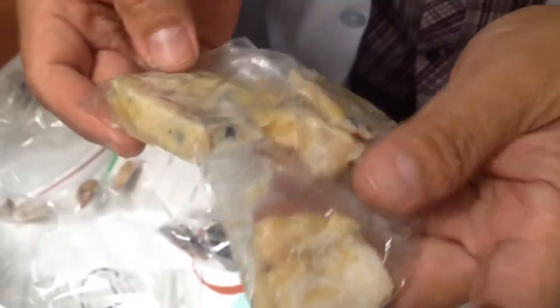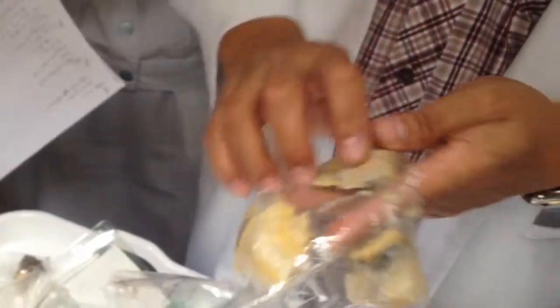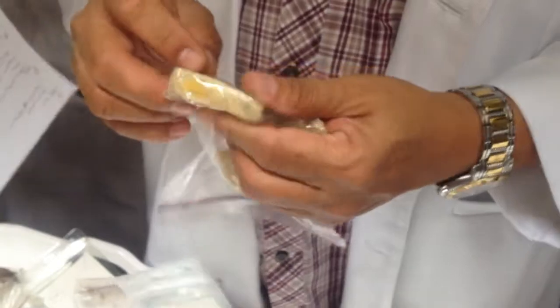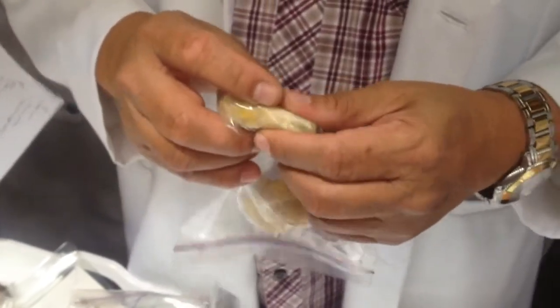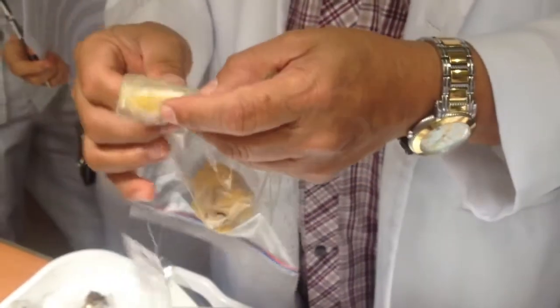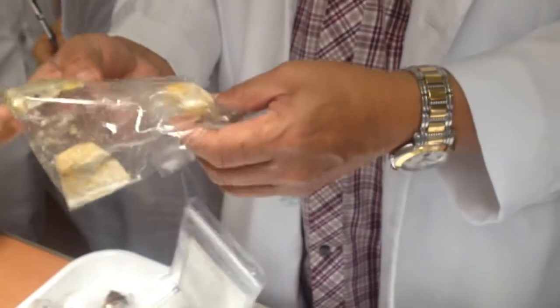Okay, so this is fibrocystic change. So the histology is important, no? As you know, the spectrum can range from simple cystic disease, which is the most benign, to epithelial hyperplasia. So you have to see the latter microscopically.